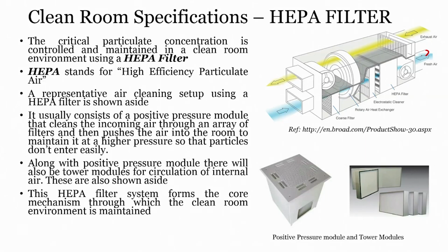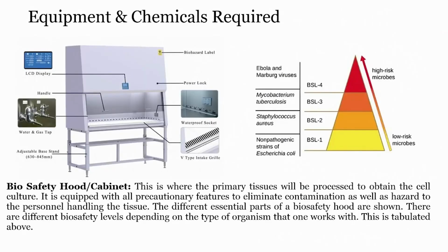Along with the positive pressure module, there will be a tower module for circulating internal air. These are also shown, right. You can see here in the figure. This HEPA filter system forms the core mechanism through which the clean room environment is maintained. HEPA filters are used to keep the clean room environment stable, right.